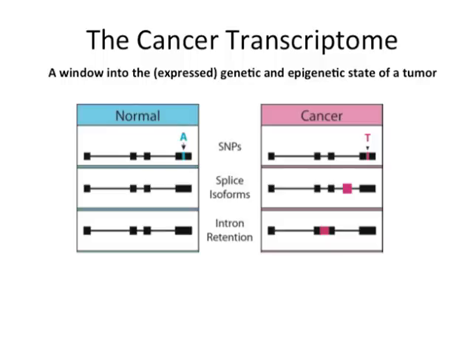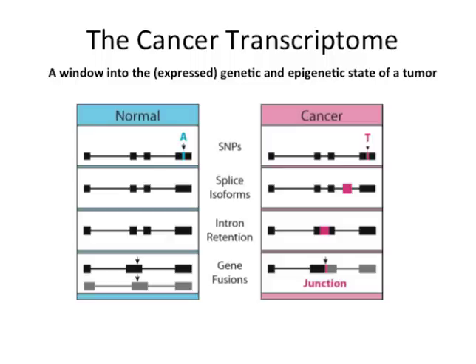Alternative splicing patterns are readily apparent, making it possible to identify cancer-specific isoforms or evidence of aberrant splicing, perhaps leading to oncogenic transcripts. RNA-Seq can hint at structural variations due to chromosomal rearrangements or translocations that often generate fusion transcripts. Fusion transcripts can sometimes be potent drivers of tumorigenesis, and their proper identification can have significant prognostic value. Another aspect of RNA-Seq is that it can be used to identify other foreign genetic elements that may be associated with that tumor sample, such as from the microbiota or from viruses being expressed.